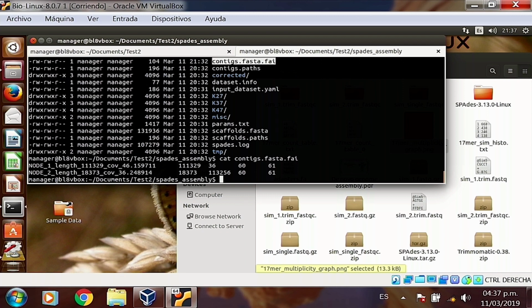It starts on byte 113,256. Why? Because that's after the first sequence, after the second name. Only then it starts the new sequence, the new AGCT sequence that corresponds to that name, right? And the characteristics are the same. It has 60 bytes per line of sequence, and the last one is going to be just a return. Yes? Any questions?